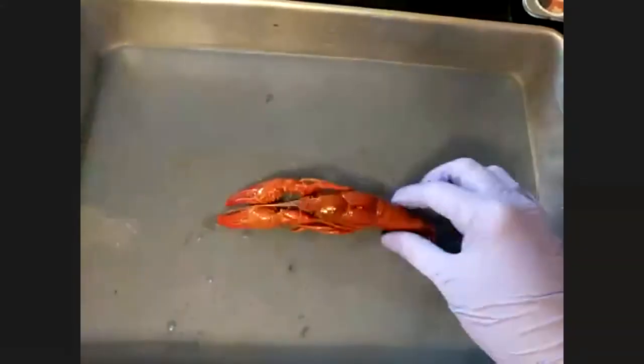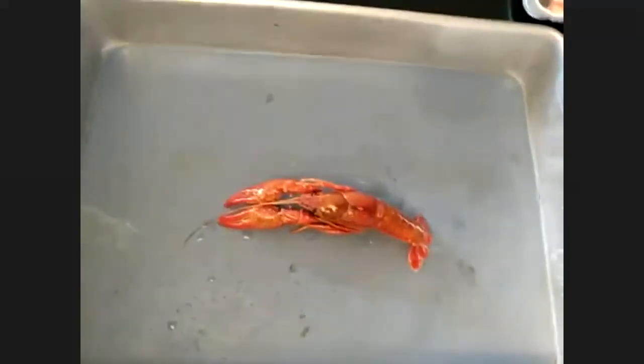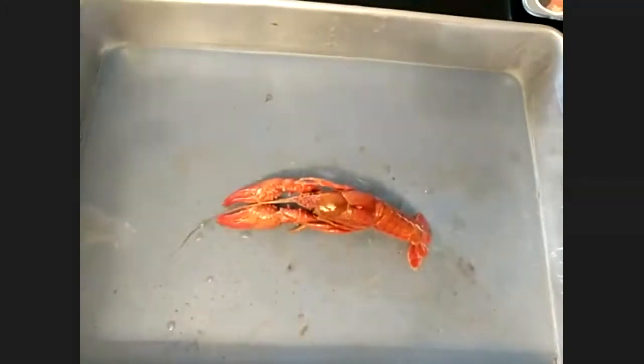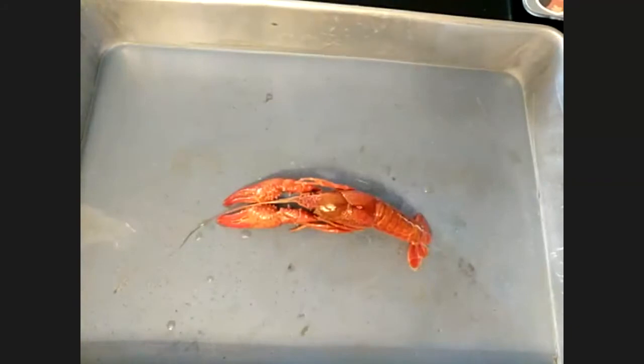So here is our crayfish, crawdad, whatever name you want to call them. Because this one has the exoskeleton, it's really, really difficult to cut through with a scalpel. I'm going to be using scissors.